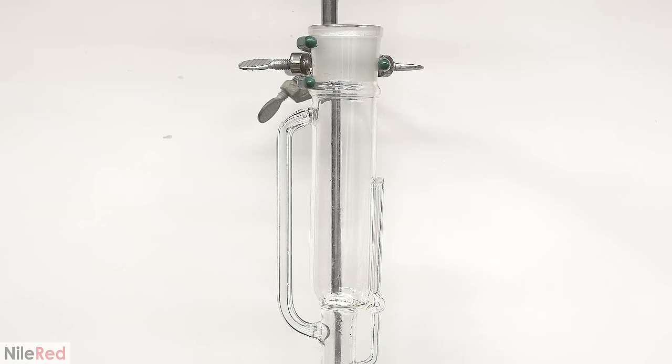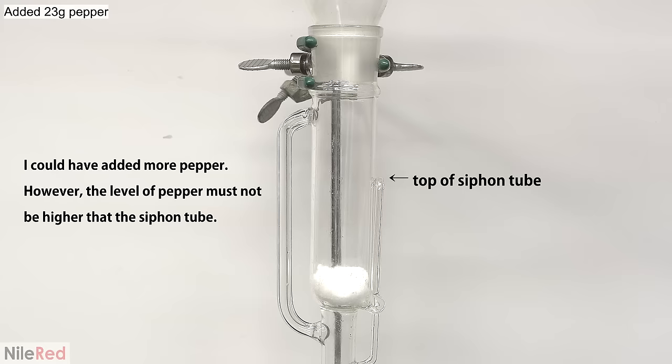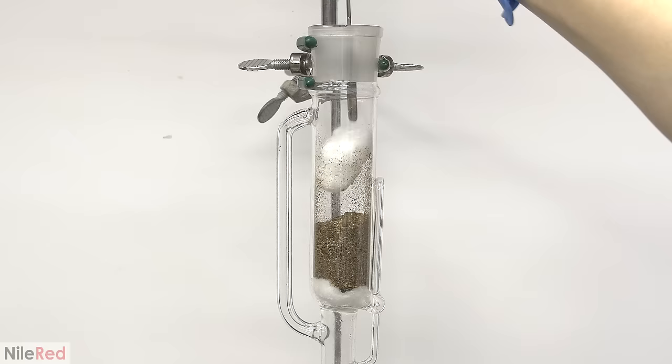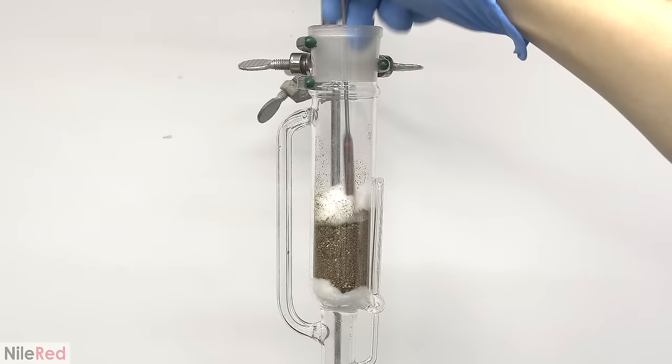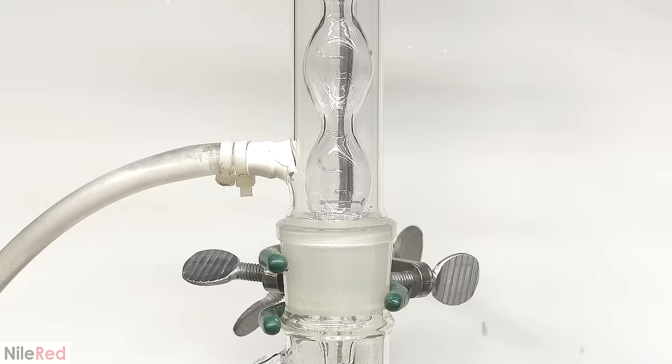I set up the Soxhlet extractor and I slide a few pieces of cotton to the bottom. At the bottom of the extraction chamber, there's a hole that leads to the siphon tube and it's really important that the cotton covers this. It's also important not to pack the cotton too tightly, otherwise things won't drain properly. Once the cotton has been placed, I pour in the chopped up pepper. I then place another cotton ball on top.